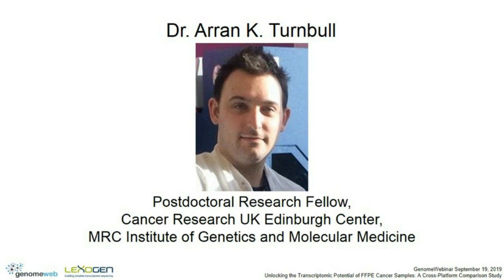So when we started about 10 years ago, we were using fresh frozen tissue samples. And to be honest, the technologies available at the time needed high-quality RNA inputs, and we didn't really have any option for FFPE tissue. But FFPE is an enormously valuable resource. They're collected routinely clinically. They're stored at ambient temperatures for many, many years, and for us, we have a tremendous amount of follow-up. So there's a wealth of available information and data that we can get from FFPE-derived RNA.